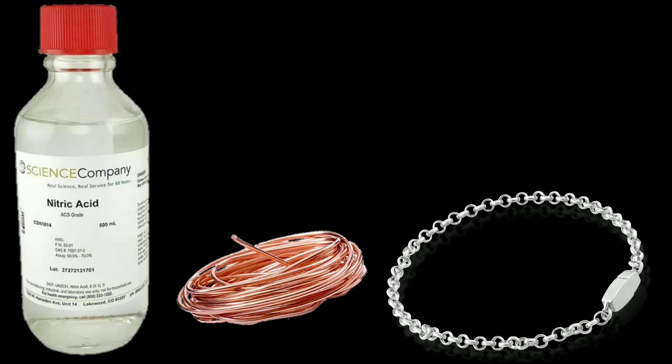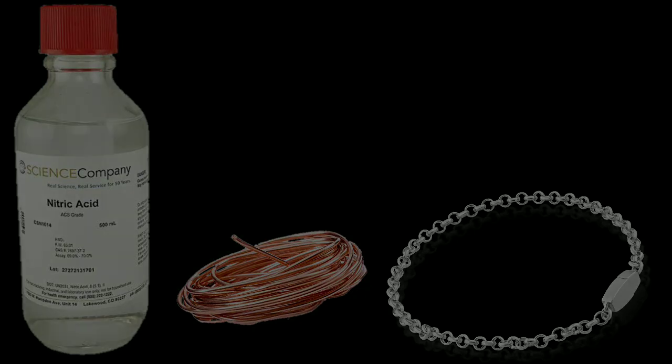For this experiment I need silver ornament, nitric acid 68%, and some copper metal.